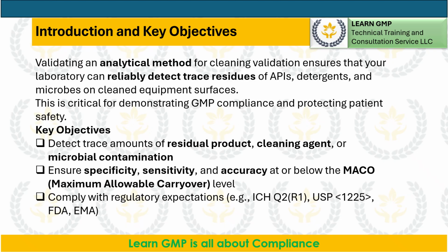Key objectives. Detect trace amounts of residual product, cleaning agent, or microbial contamination. Ensure specificity, sensitivity, and accuracy at or below the MACO, maximum allowable carryover level. Comply with regulatory expectations, for example, ICH Q2(R1), USP <1225>, FDA, EMA.